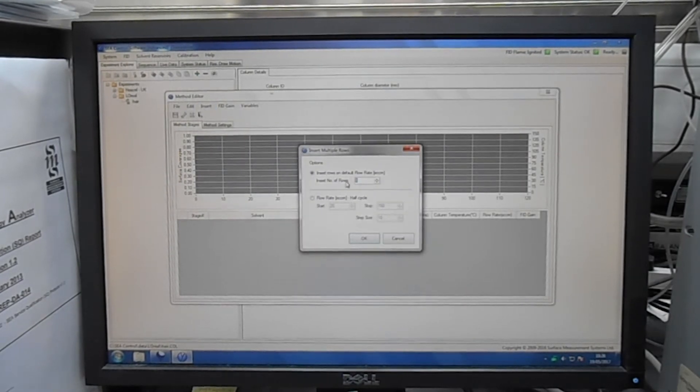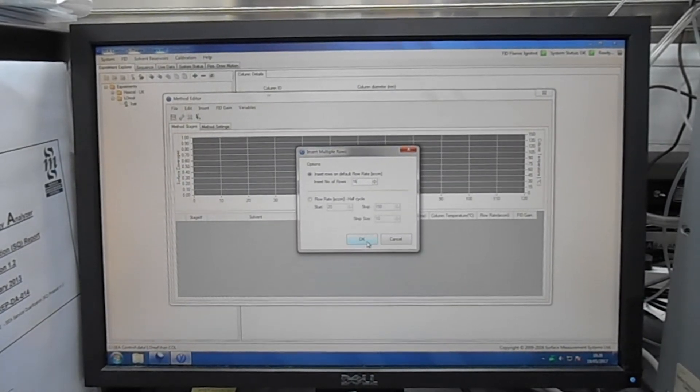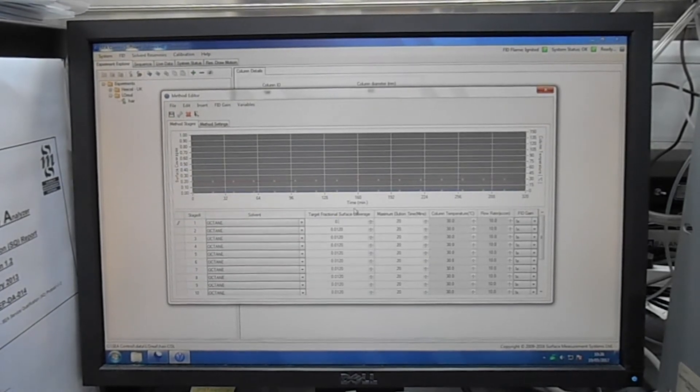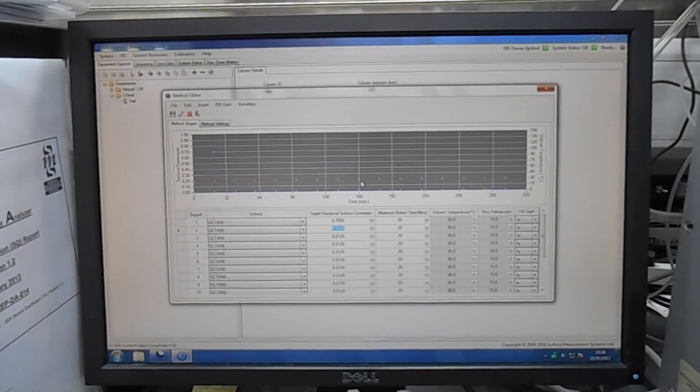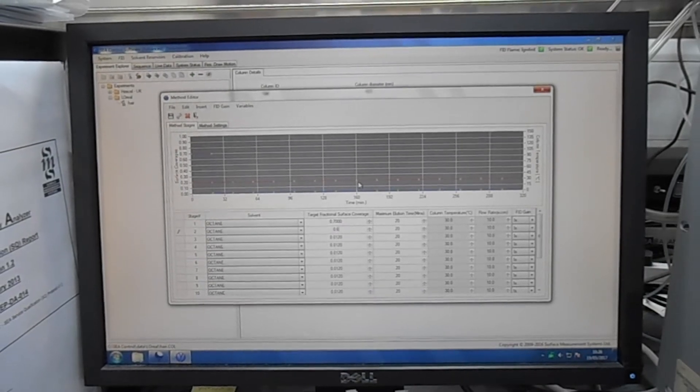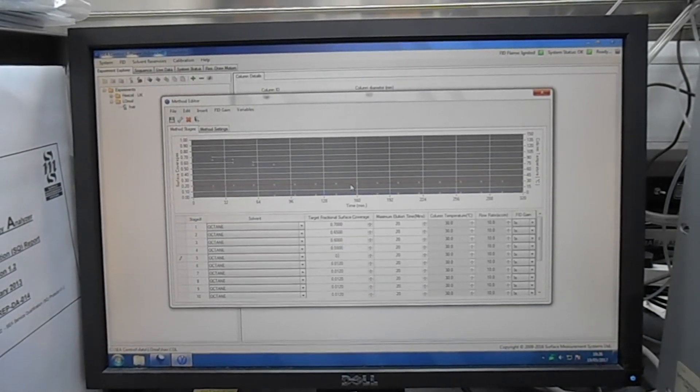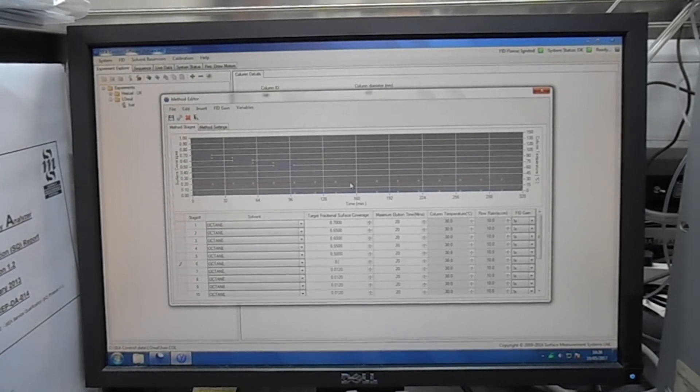So what we are going to do is a series of injections of a single probe, in this case octane, from high to low volume. So we start from a very high volume and then we decrease step by step the volume as a single injection.